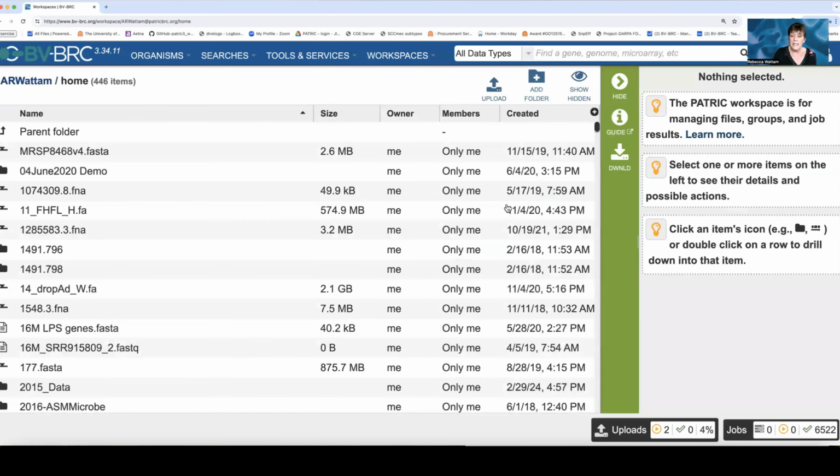So that's the way to do it if you've uploaded something into the workspace and you didn't tag it correctly. And so we're still waiting. Look down here at uploads. We're still waiting. It's 5% and 3%. So once it gets to 100%, we'll be able to start this job.